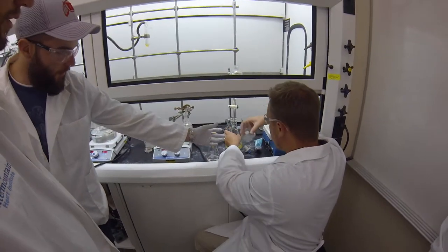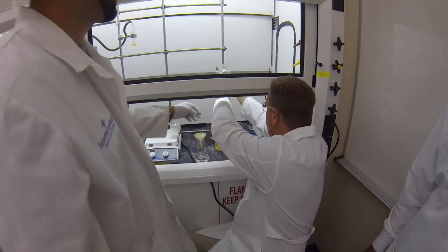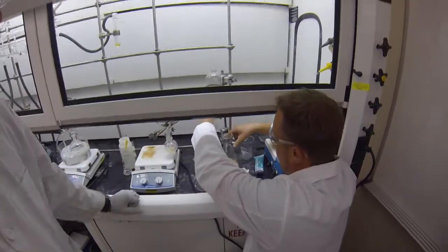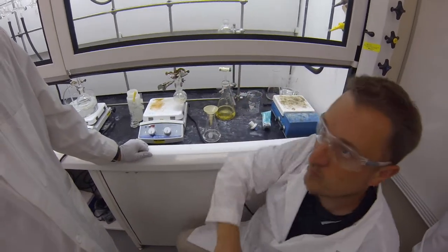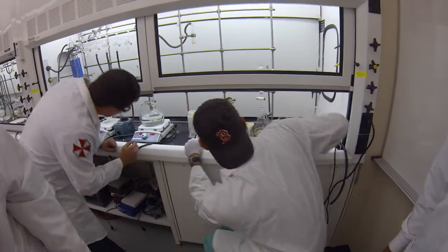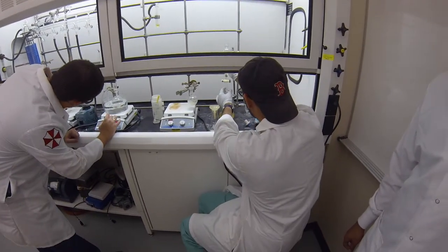So what are you guys doing? We are trying to purify our dipeptides. We're doing HCl washes, brine washes, and now we're prepping for sodium. Did you guys actually find the 2 molar HCl? No. We made it. You made it? We made it from 3 molar. Wow, look at you guys.